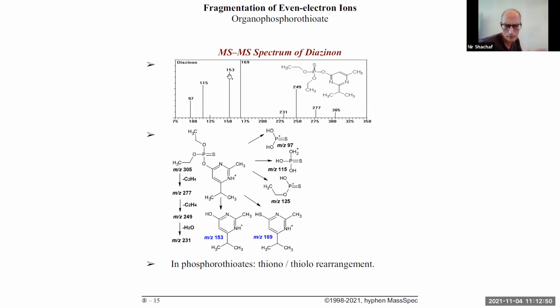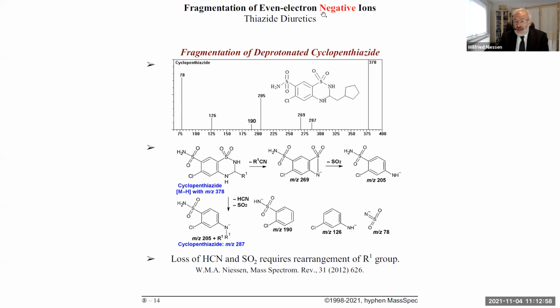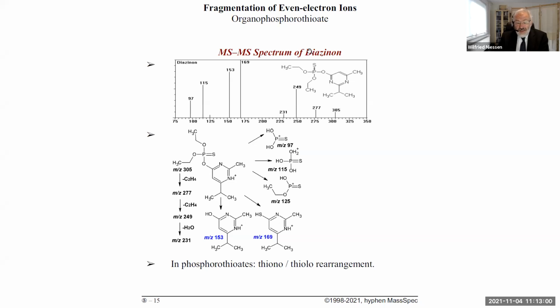And that's the negative ion mode, right? No, this is the positive ion mode. Oh, okay. Because there's no negative here. Negative is there if I have negative in the heading. Oh, this is positive ion mode. These are pluses all the time. So you are by default positive.